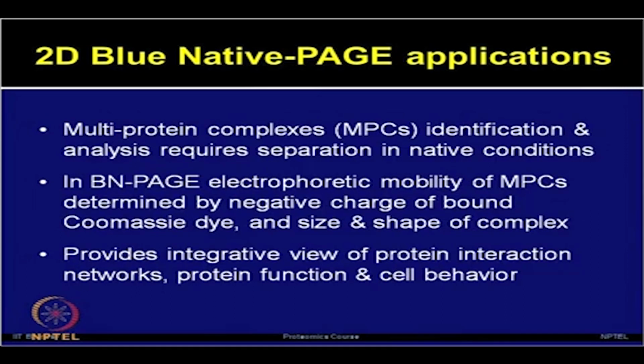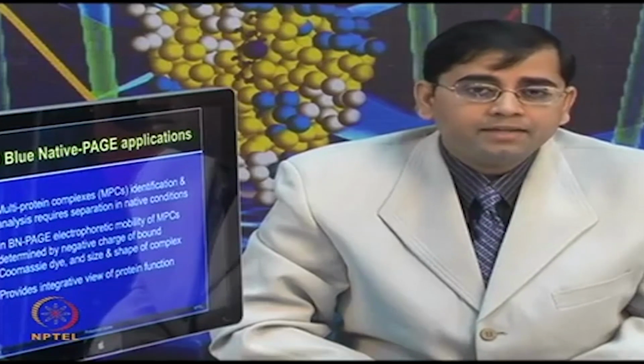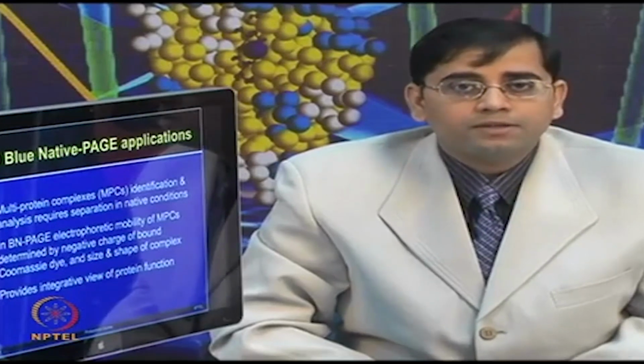So, MPCs can be identified by using the blue native PAGE. In blue native PAGE, the electrophoretic mobility of MPCs or multi-protein complexes is determined by the negative charge of bound Coomassie dye and the size and the shape of complexes. So, this technique can provide the integrated view of protein function.